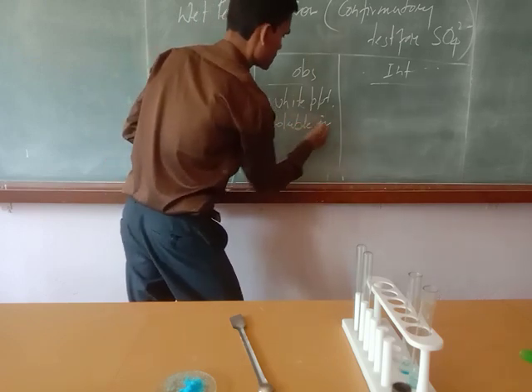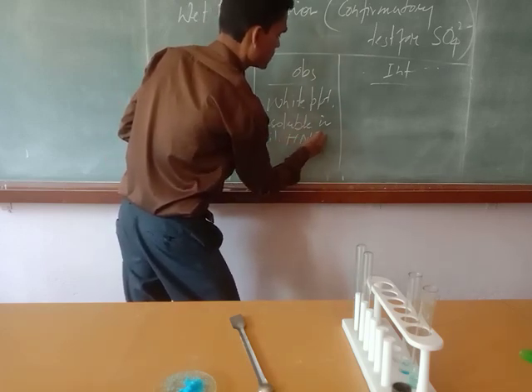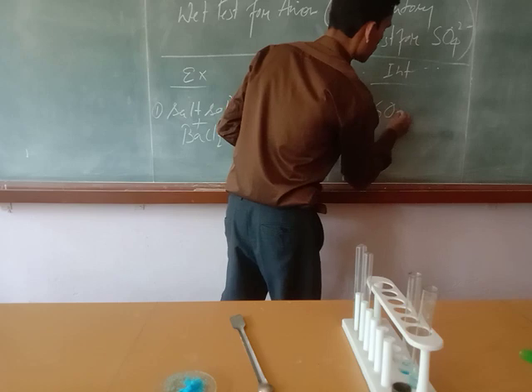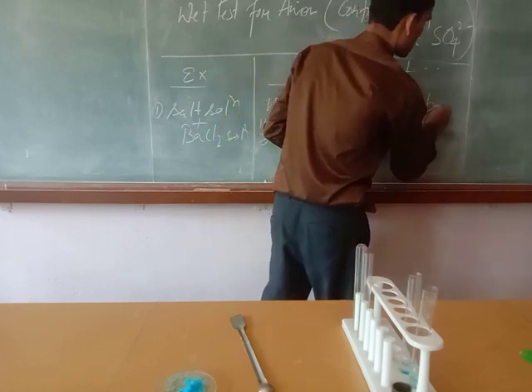Insoluble in dilute HNO3. So this is the observation for sulfate radical. Here SO4 2 negative is present.